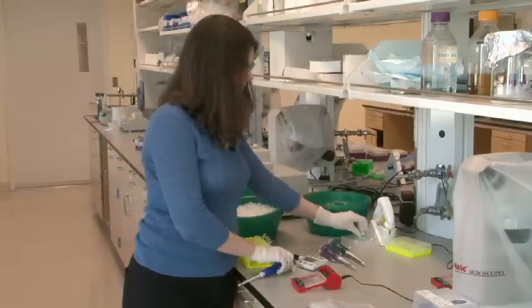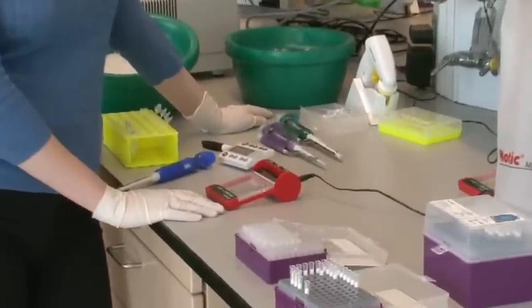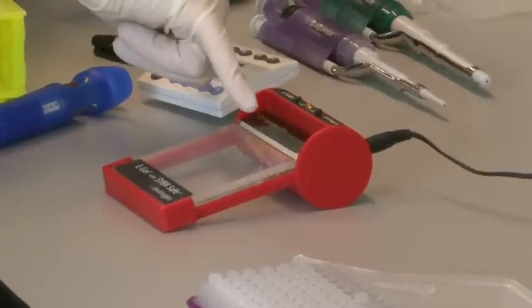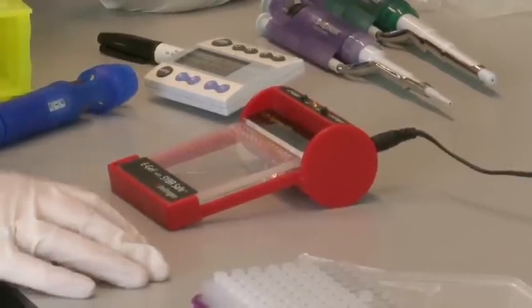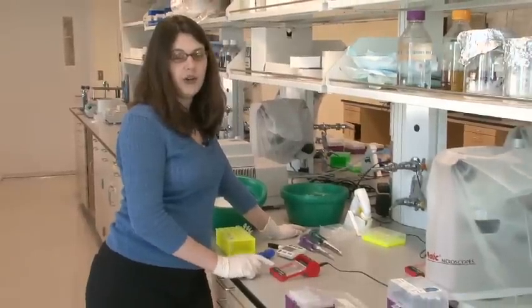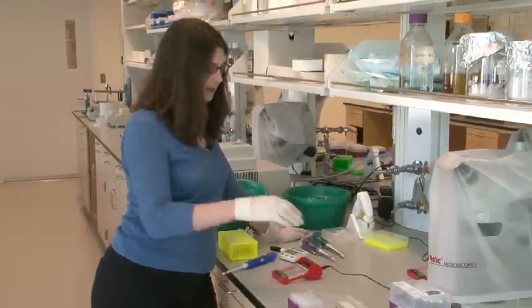So now what I'm going to do is I'm going to hit this button, and that starts the current running through the gel. So now the DNA samples are going to move from the holes where we loaded them all the way down to the end of the gel right here. And so you'll see the orange dye progressing. The orange dye, remember, is not actually the DNA. The DNA is transparent and you can't see it at this step. But the orange dye allows us to see that the samples are traveling. Once the orange dye reaches the end of the gel, we'll expose this gel to a certain wavelength of light, and that will allow us to see the DNA.